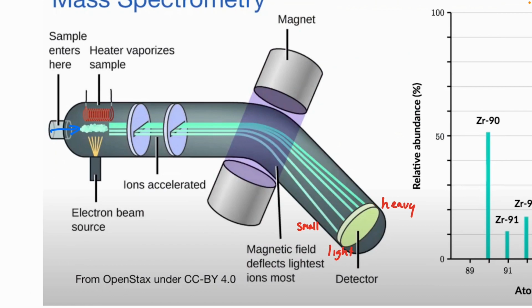So for that detector, I'm sure you would know this, but as you're saying, it'll hit different parts of it. Is the detector split up into sections? It's like a line, kind of. Okay. Over here is where the heavy particles hit. Over here is where the lightest particles hit. And anywhere in between, I can tell how much that particle weighs because it got diverted a certain degree in my field.